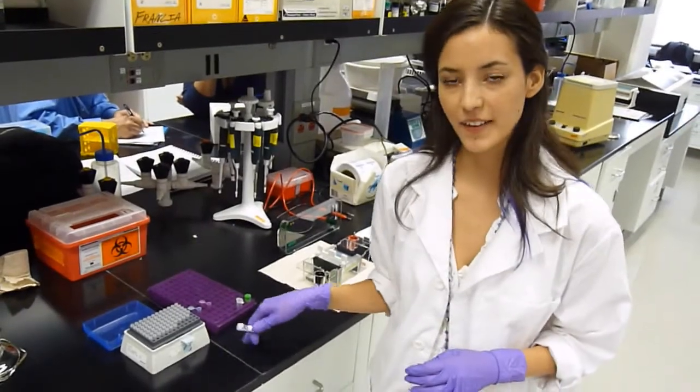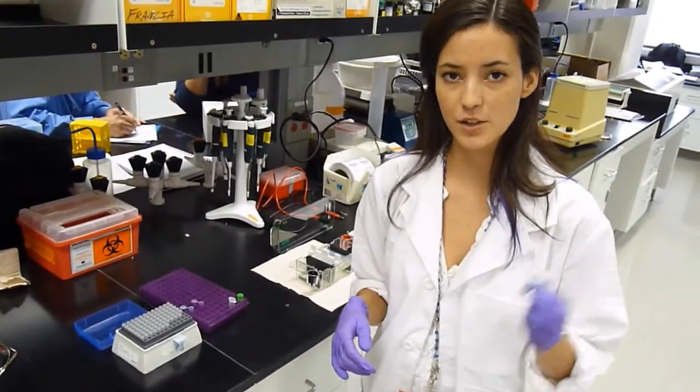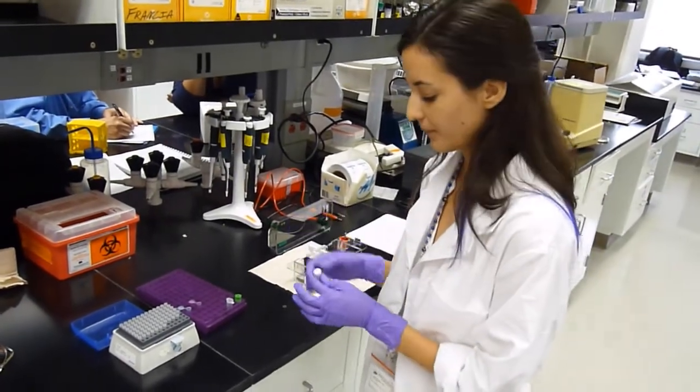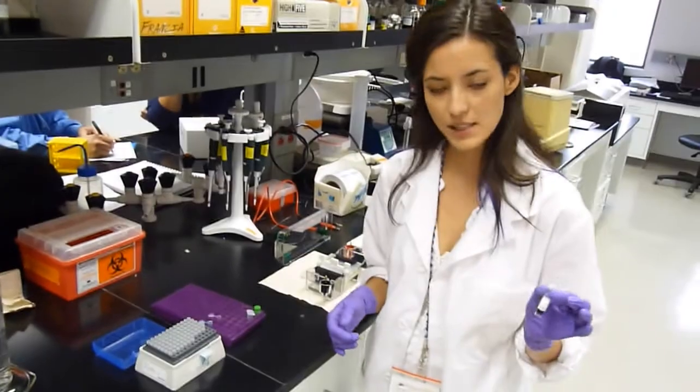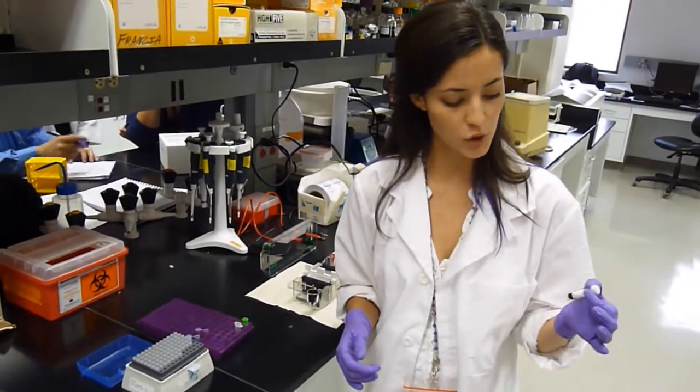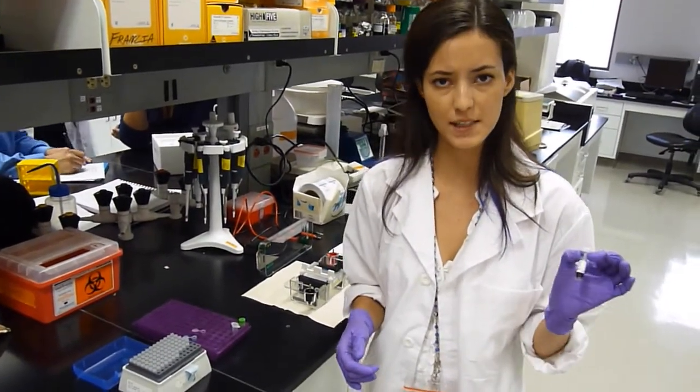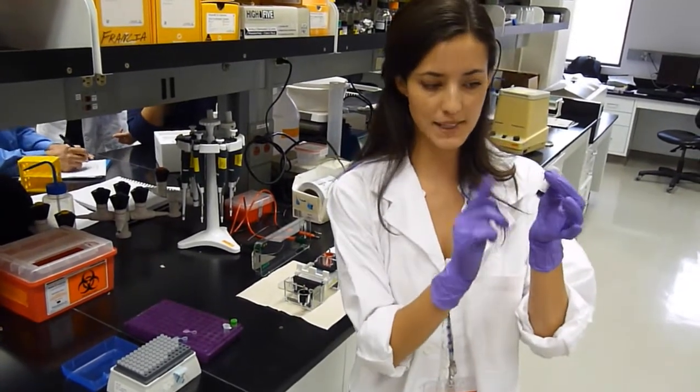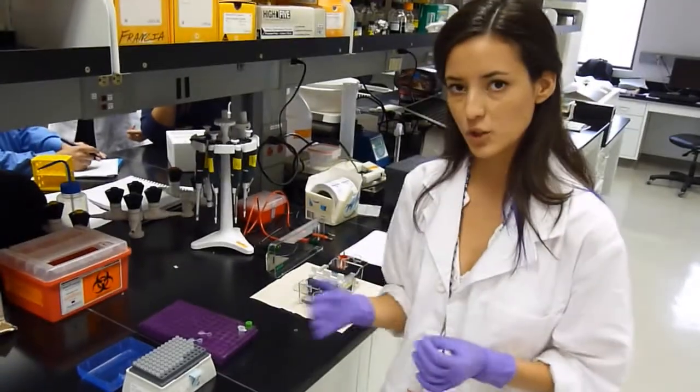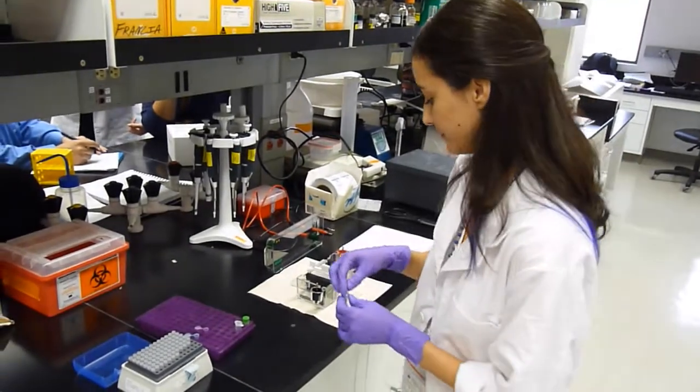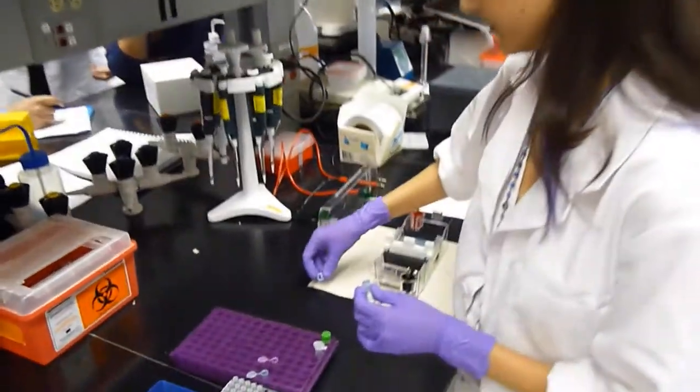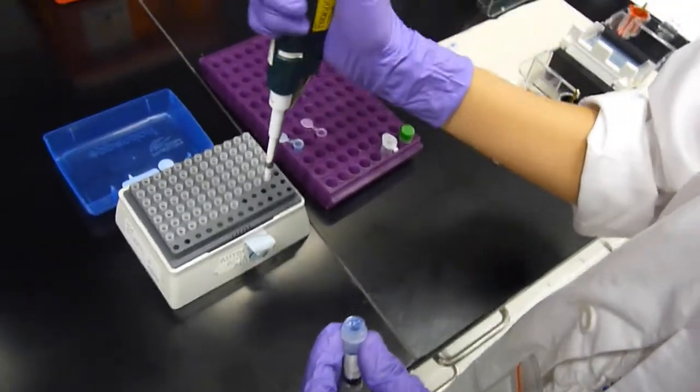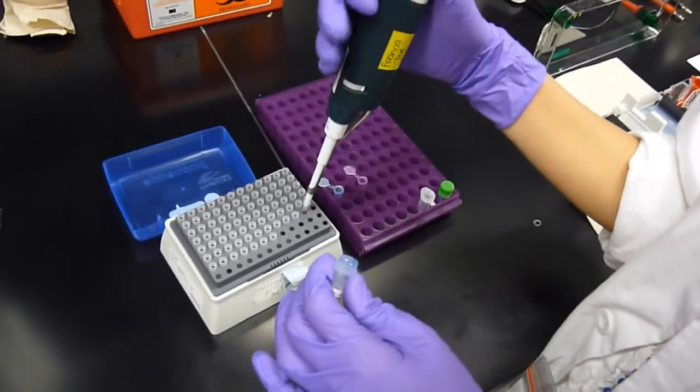So we just added our DNA, now we're going to add our 10 times loading buffer so we can visualize it moving in the gel so we can know when it's done. Before adding this, for this one I have to warm it up to 36 degrees Celsius for 10 to 15 seconds and make sure to mix it before creating your sample. So I'm just going to take 3 microliters of this.